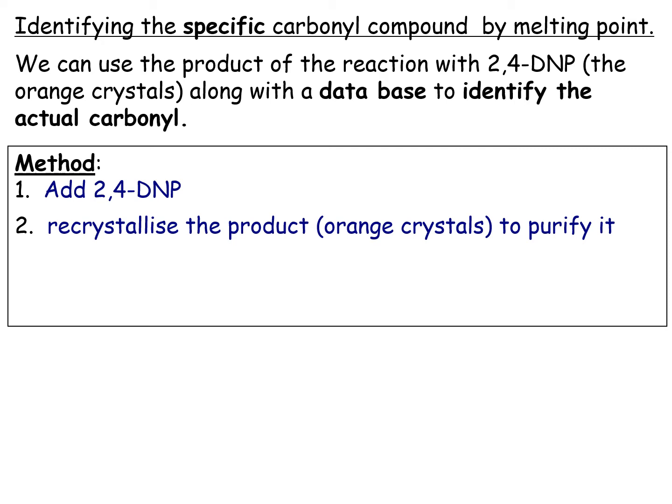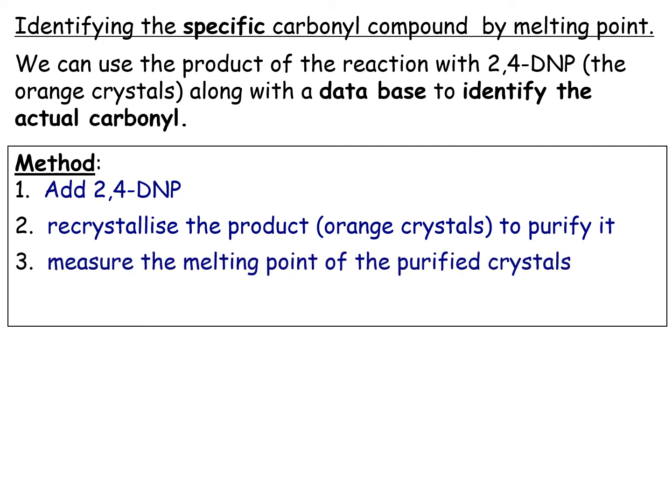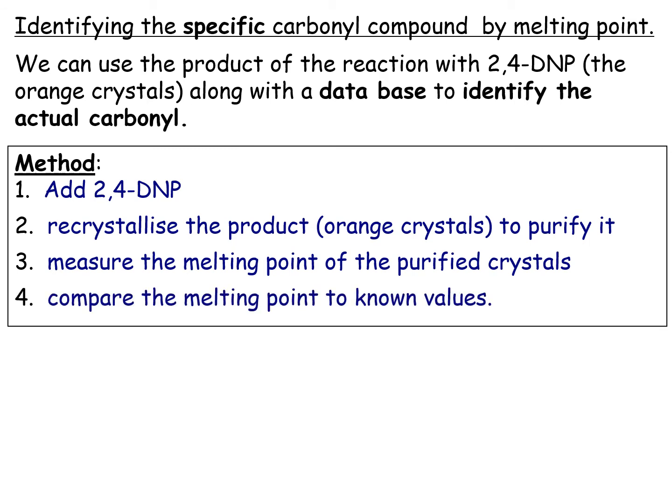Then what do you do? Well, you take those crystals and you measure the melting point. Hopefully it'll give you a nice sharp melting point because you've purified. And then the final step is you compare that melting point to known values.